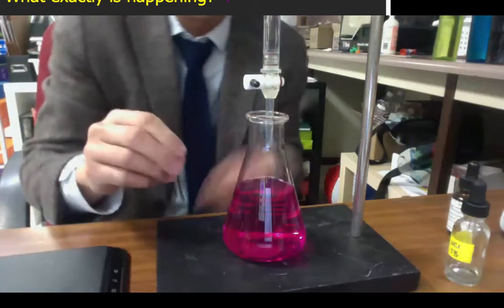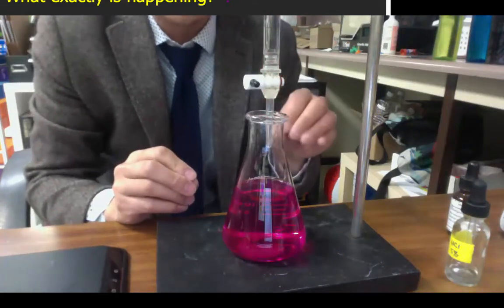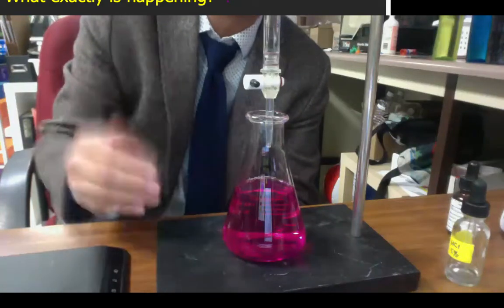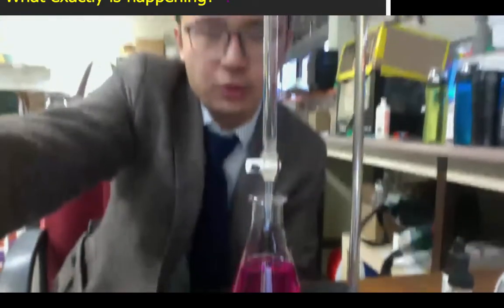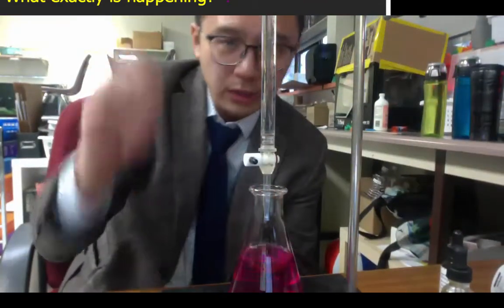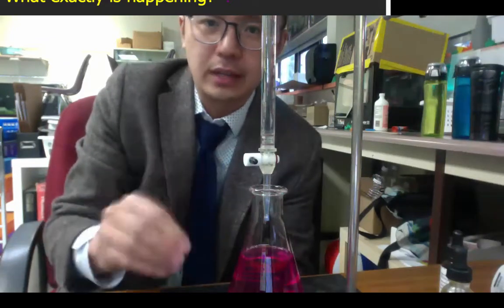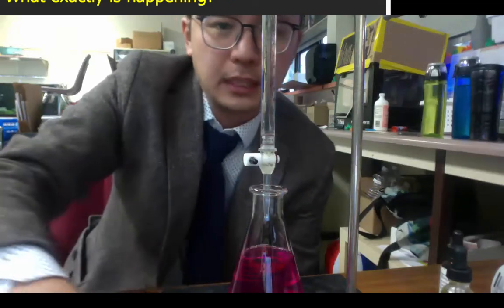You want to end it when you get that first color change and it doesn't revert back to colorless. That's when you stop. You don't want to be doing this, because just for time's sake, I just wanted to show you what that means for overshooting. But when you want to stop, you want to have the solution change colors and not go back to colorless. That's when you stop. Okay, that's your titration.